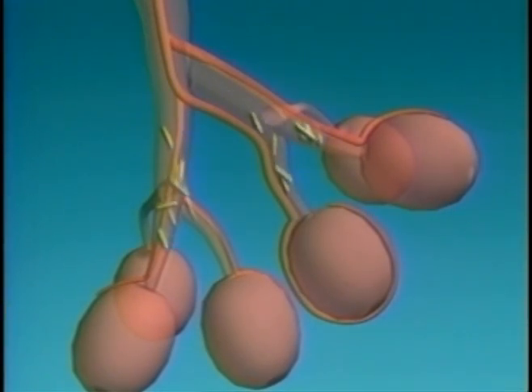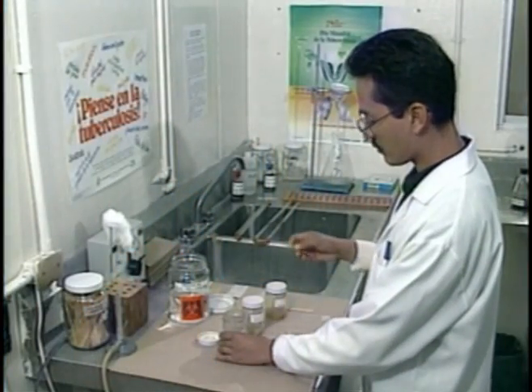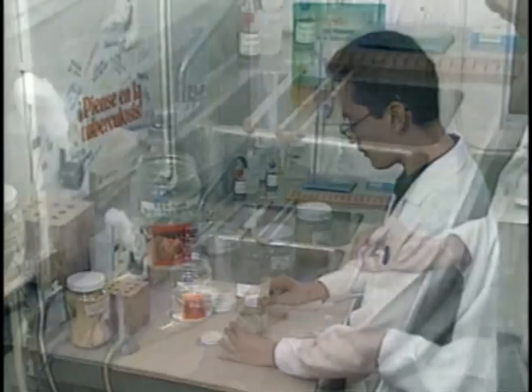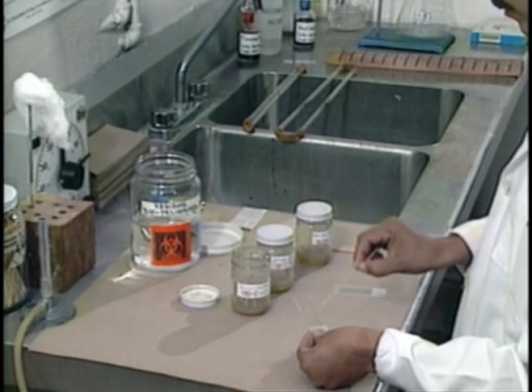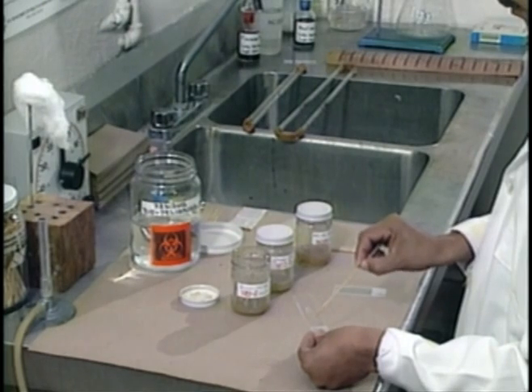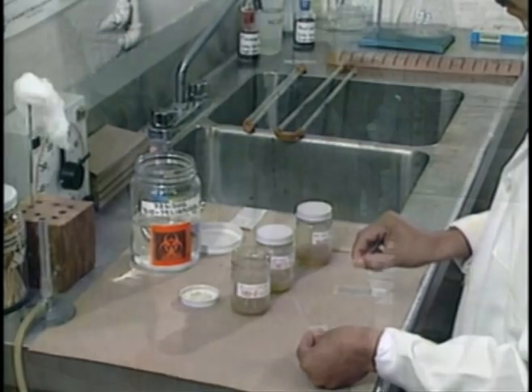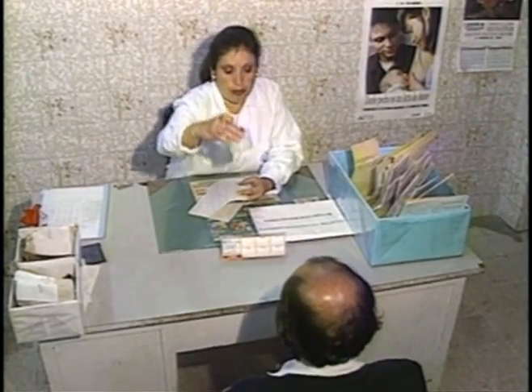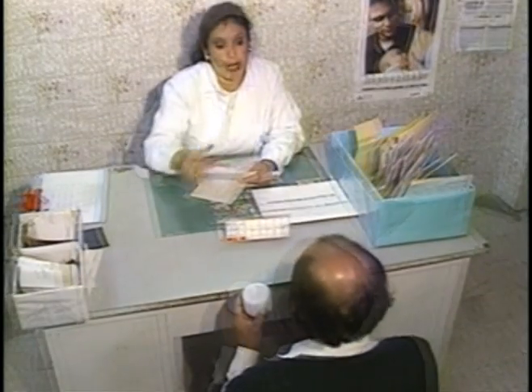This is especially dangerous in a confined area. Keep in mind, when appropriate techniques are employed, there is very little risk of acquiring infection in the laboratory. It is vital that all personnel be aware of potential hazards and work in a careful manner. The greatest risk of infection in the laboratory involves sputum collection. Preparing smears presents less risk to the lab worker than exposure to direct coughing.